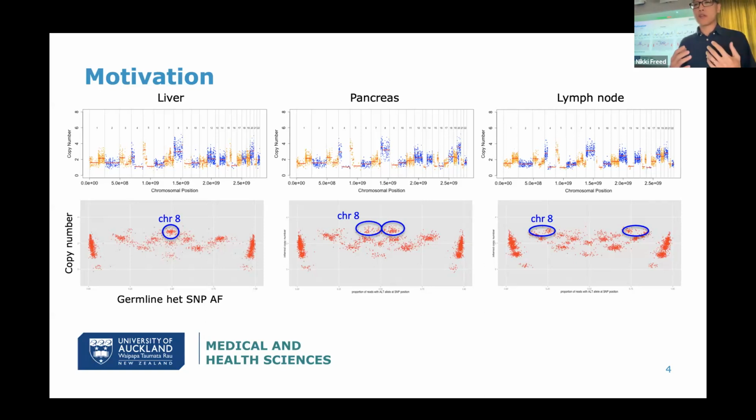But the pattern of this aneuploidy in the tumor is so extreme that it must have been linked with some sort of structural change. However, using short reads, we can't detect any structural variant that we think were real. So we kind of just parked this whole thing on the side for a while.